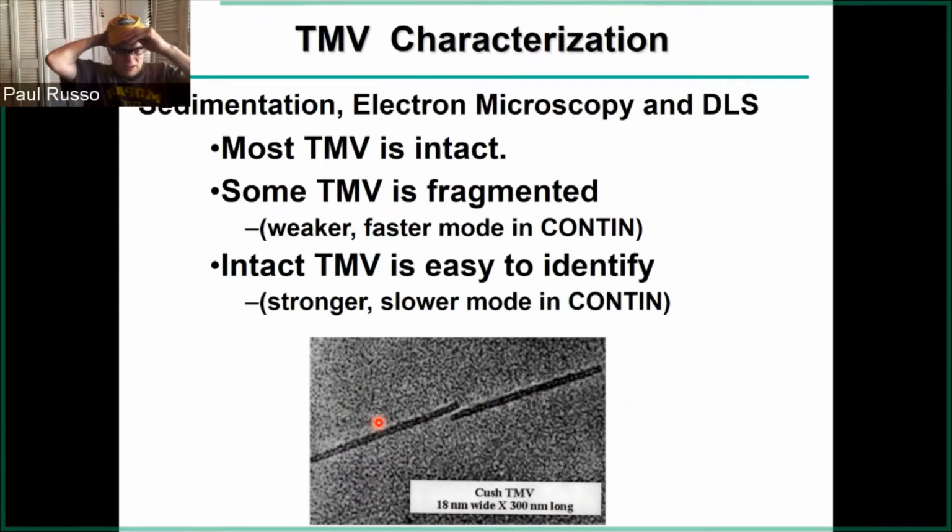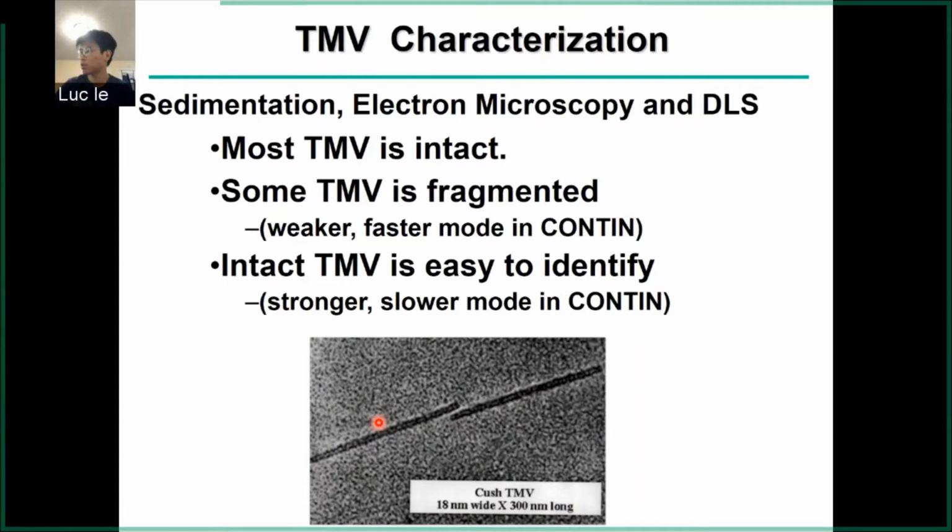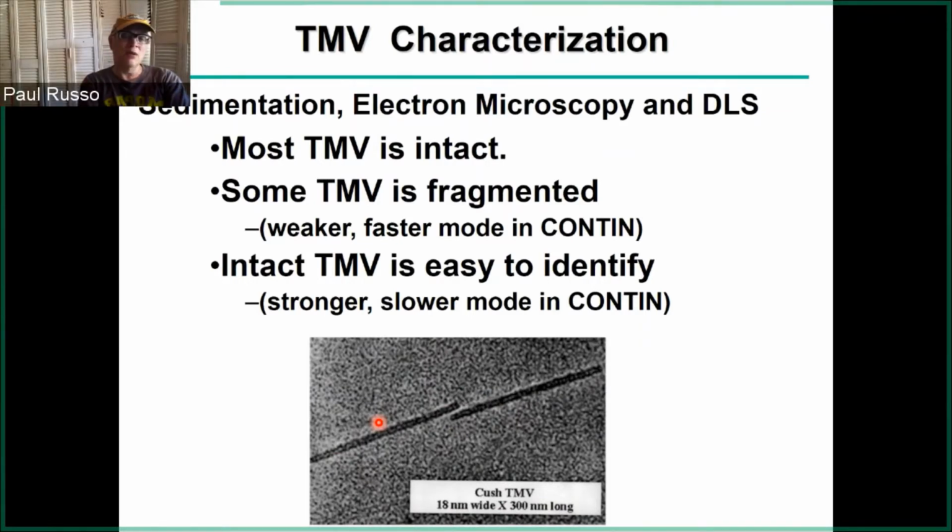Is this the virus? That's a plant virus. Why is it rod-like? Plant viruses often are rod-like. We're so used to seeing this coronavirus that's a round virus. Is it because they can get in those tracheae, the xylems, the plant blood vessels? I don't know. Water vessels. I don't know why it is. I think it's just evolved that way.